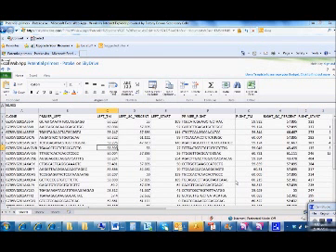Okay, so obviously the data that you're going to be given is going to be in the form of an Excel spreadsheet, and there's a good reason for that. Excel is a piece of software that allows us to handle lots of data efficiently and accurately, and that's exactly what we want you to do here. To be honest, you could go through all 150 or 900 or however many primers or microsatellites you've got to choose from manually, counting the number of repeated bases and identifying the numbers that are over 40 or under 60, whatever. But the point of putting them on an Excel spreadsheet is so that you use the software to be more efficient and more accurate, just like scientists are in the real world.